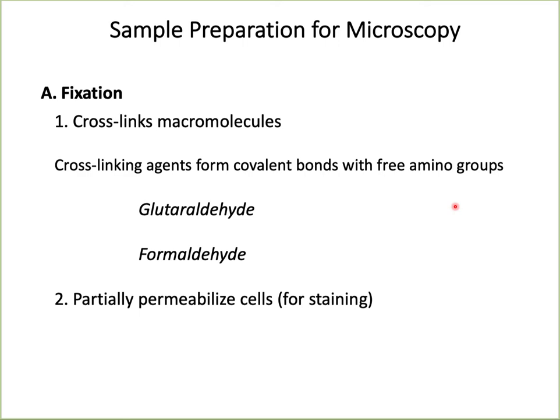Lower eukaryotic cells are motile. All the movement complicates microscopy because as the cells are moving around, the resolution is lost, so the image is blurred. Fixation takes care of actually freezing the cells and stops all movement. It also kills them, which may be good or bad. Fixation freezes the cells in time and stops all the motion so you can capture a good image.